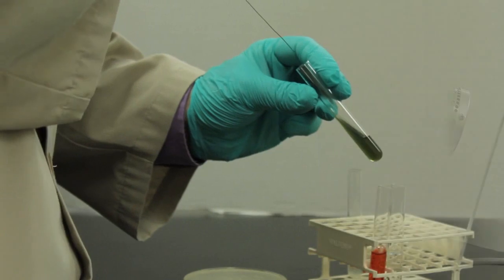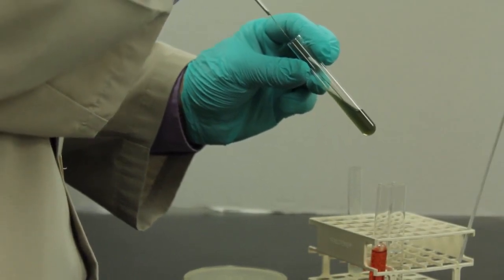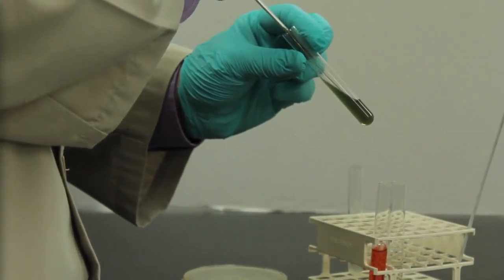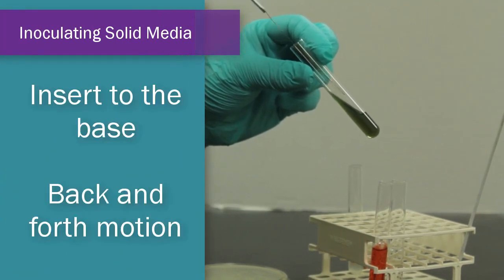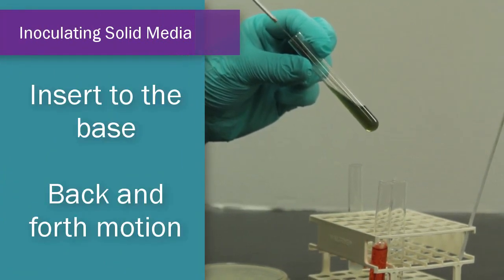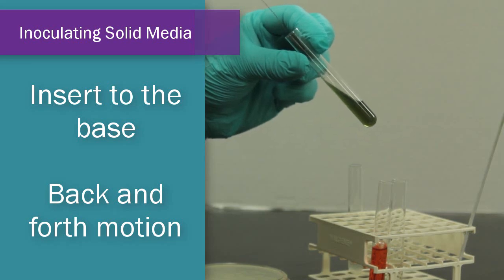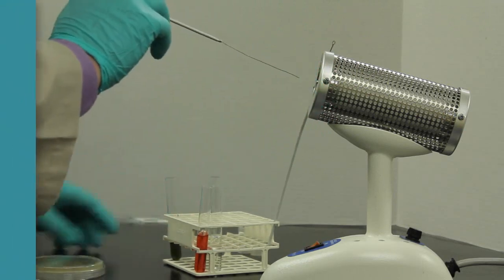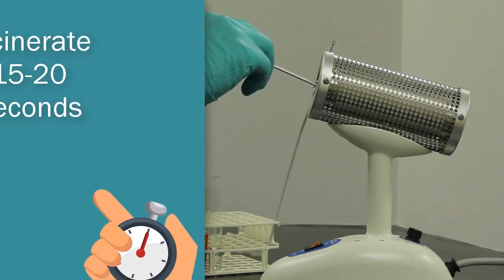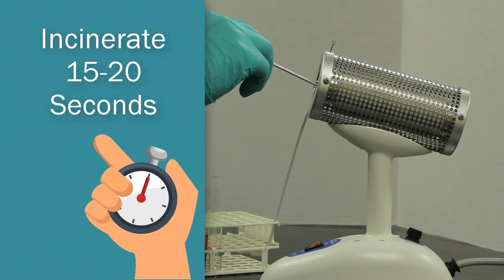Insert that needle into the center of the agar. Go directly down the center to the base. Once I feel it stab the base, I'll pull it right back out the same insertion point. And with a brisk back and forth movement, I will inoculate the slant itself. Once I've done that, incinerate the needle for another 15 to 20 seconds and you're ready to go again.